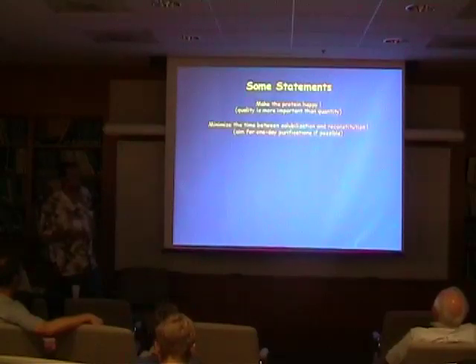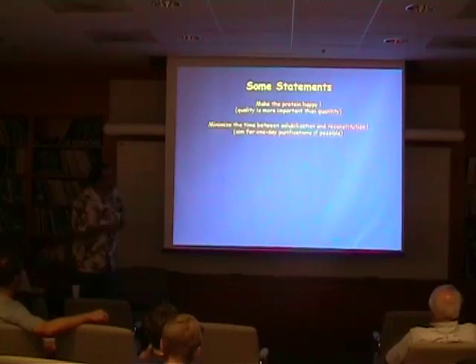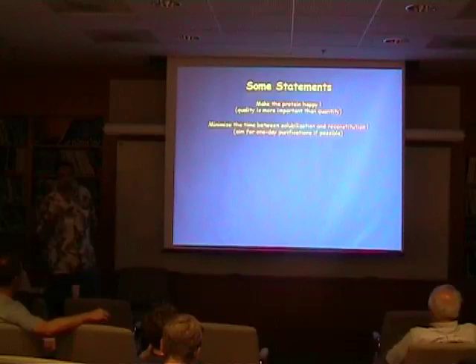So we can work with harsher detergents than X-ray crystallographers, for example octyl glucoside to make the dialysis fast, and so on. That's another thing I believe in: you want to minimize the time the protein is only in detergent, and then you can use harsher detergents.